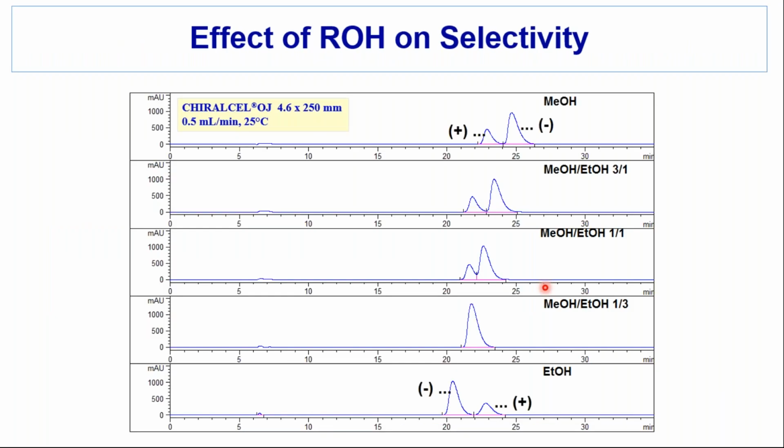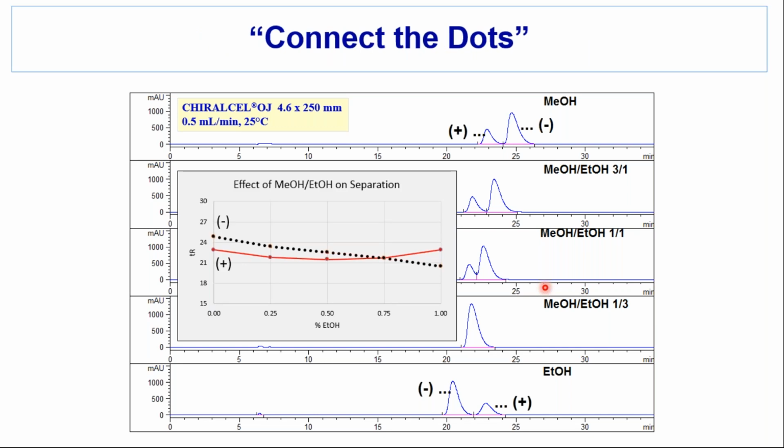So we talked about this earlier, where we saw some change in retention of this endocrine disruptor as we changed the mobile phase solvent. And I said, well, we can make little plots, and this gives us a visual way to see the change. I hadn't really noticed that before I did this, but I didn't really think quantitatively about what this curve might actually look like.